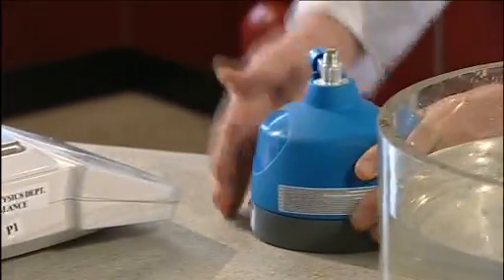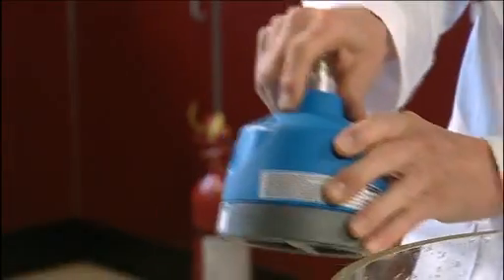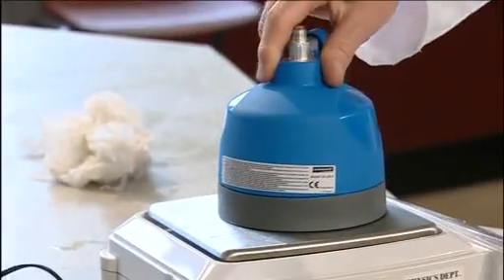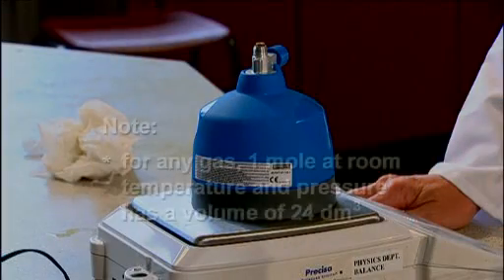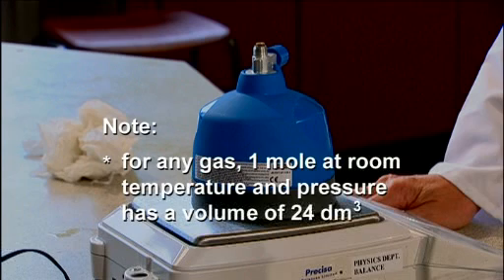Make sure there are no droplets of water on the cylinder which would affect the weight. We can re-weigh on the top pan balance. You find that something like 2 grams of gas have been used. Using the approximation that 1 mole of any gas at room temperature and pressure has a volume of approximately 24 cubic decimeters, the relative molecular mass of the gas can be calculated simply by multiplying by 24.